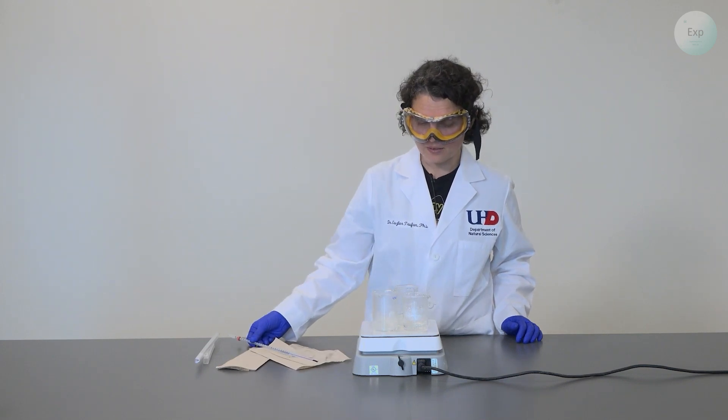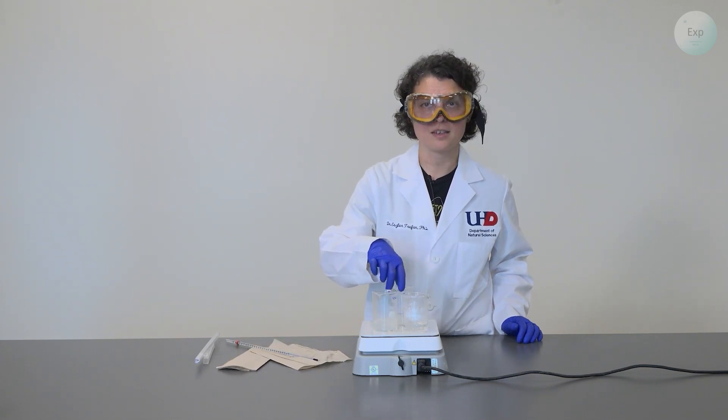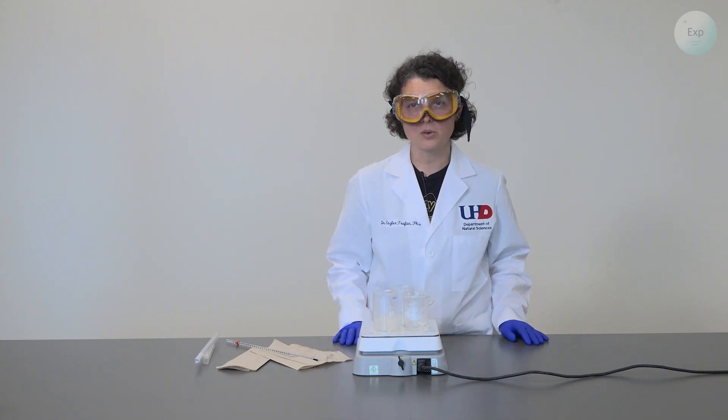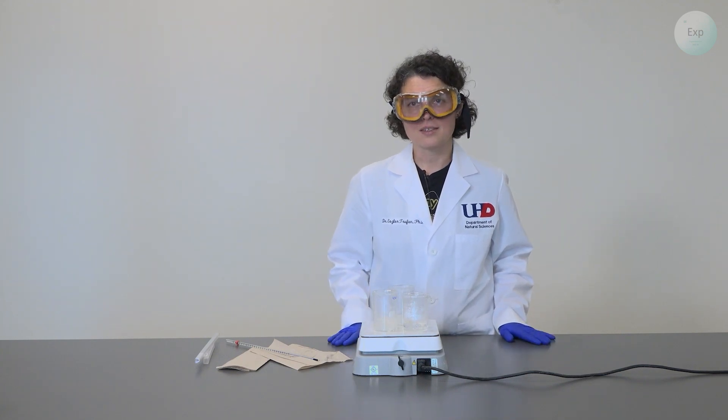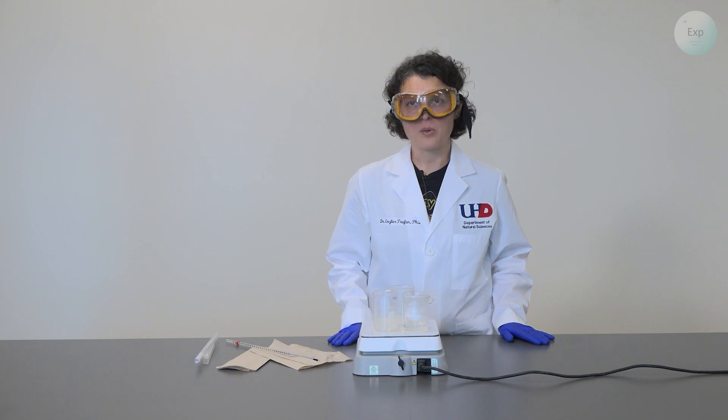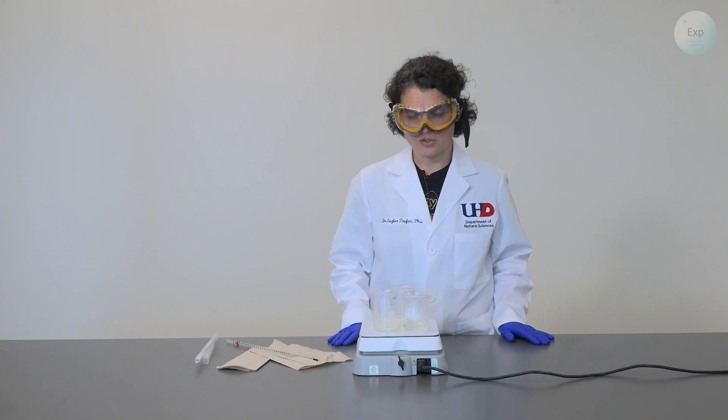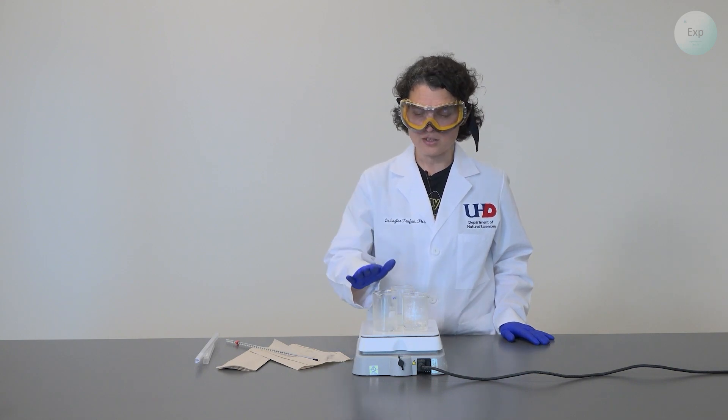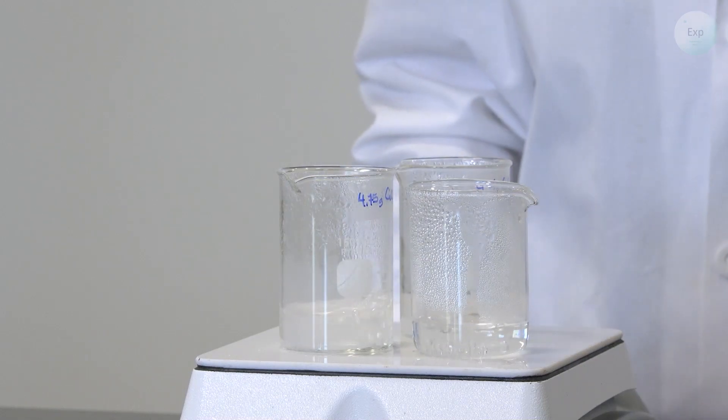We will do the same thing with the solution that contains the 9.5 grams of calcium chloride. We will record its boiling point and then we will proceed with our calculations to determine how the addition of the different amounts of calcium chloride have impacted the boiling point of water.